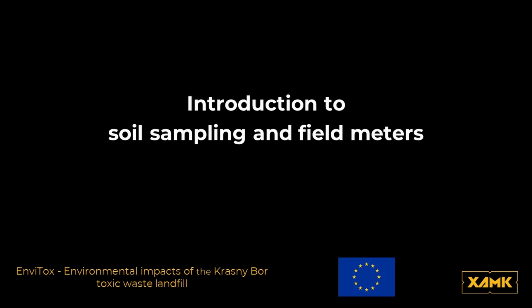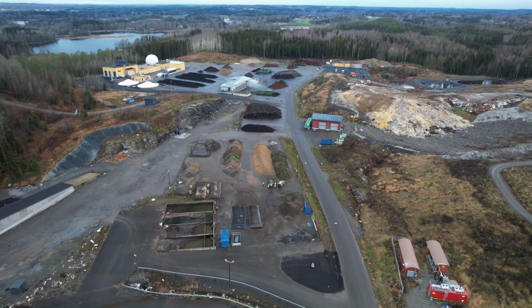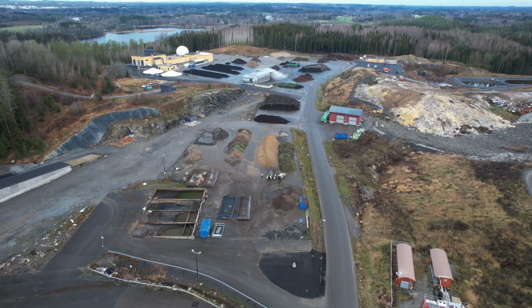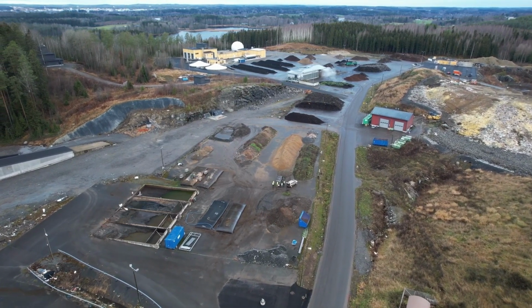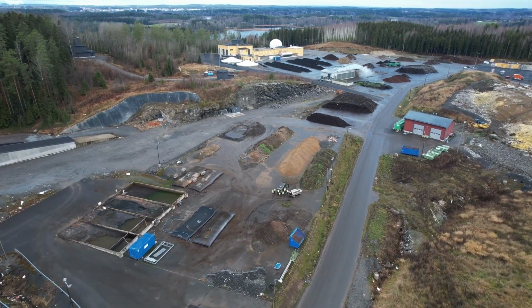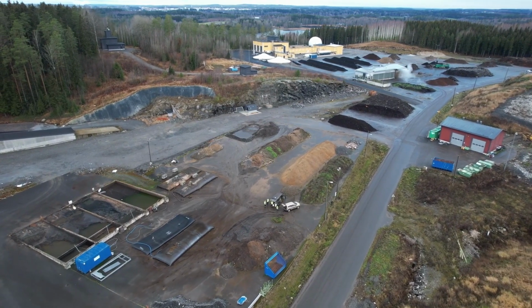This video describes soil sampling in general and field meters suitable for analyzing soil. Soil contamination should be assessed, for example, when new operations such as construction will begin in the area. Soil assessments may also be required after accidents, sometimes urgently, to identify pollutants and prevent them from spreading. When examining soil contamination, it is important to find out what contaminants there are in the soil and what are their environmental concentrations. If the soil is found to be contaminated, the necessary remediation can begin.